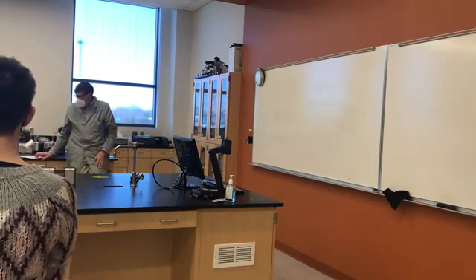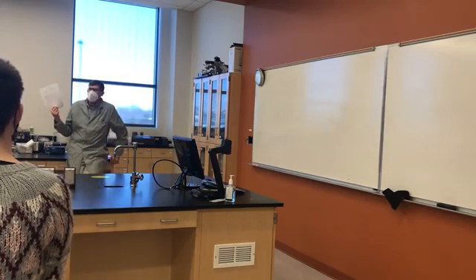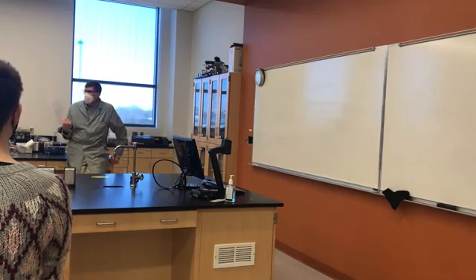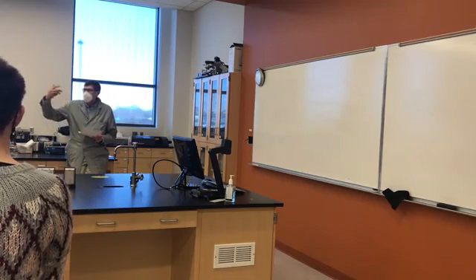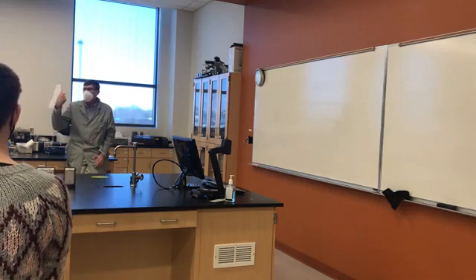Okay, I should mention on your lab write-up this week, it'll be a little bit different since this is kind of a demonstration. What you'll do this week is just discuss the spectra of the different samples, how we identify what each spectrum is, and answer the questions that are asked in the handout.